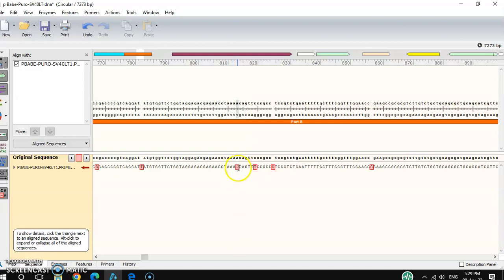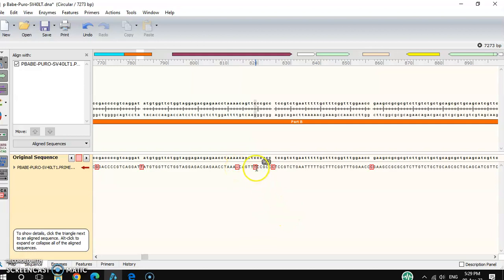If you see a dash in your sequencing result, it indicates a deletion mutation — meaning one base pair has been deleted. Here, in the theoretical sequence there is an A base pair, but that A is deleted in the sequencing result. Also, there is a substitution mutation where the theoretical sequence had C, but it has changed to T. So there are three different kinds of mutations: insertion, deletion, and substitution.